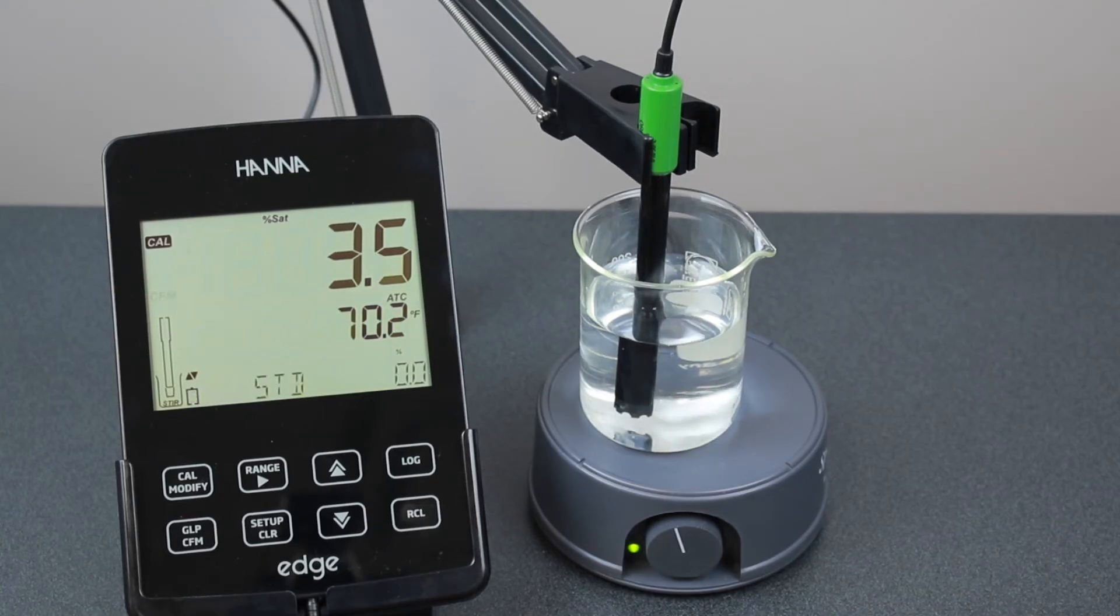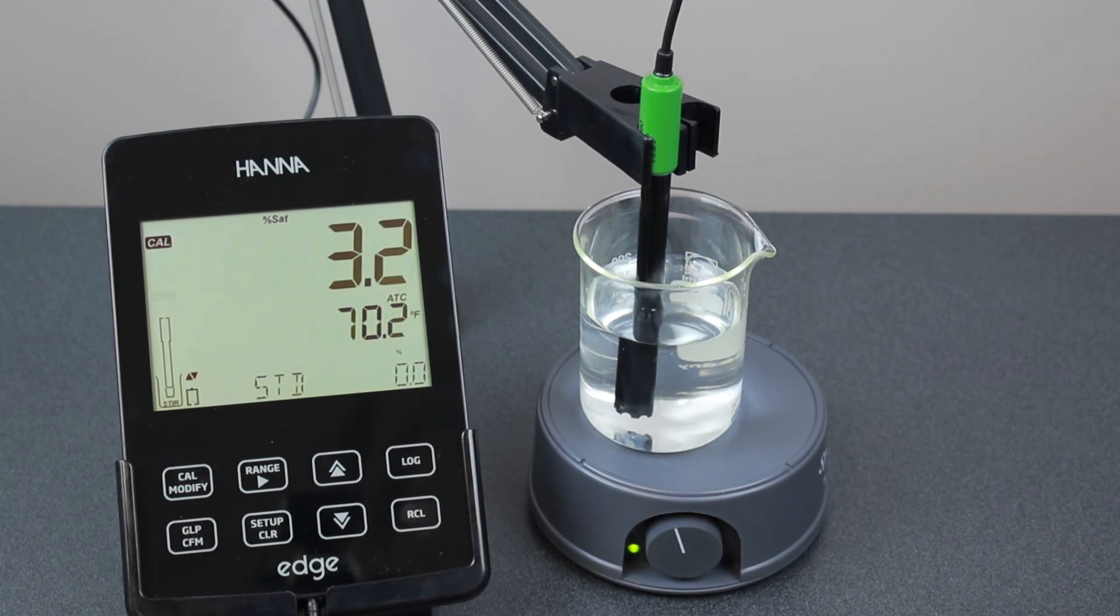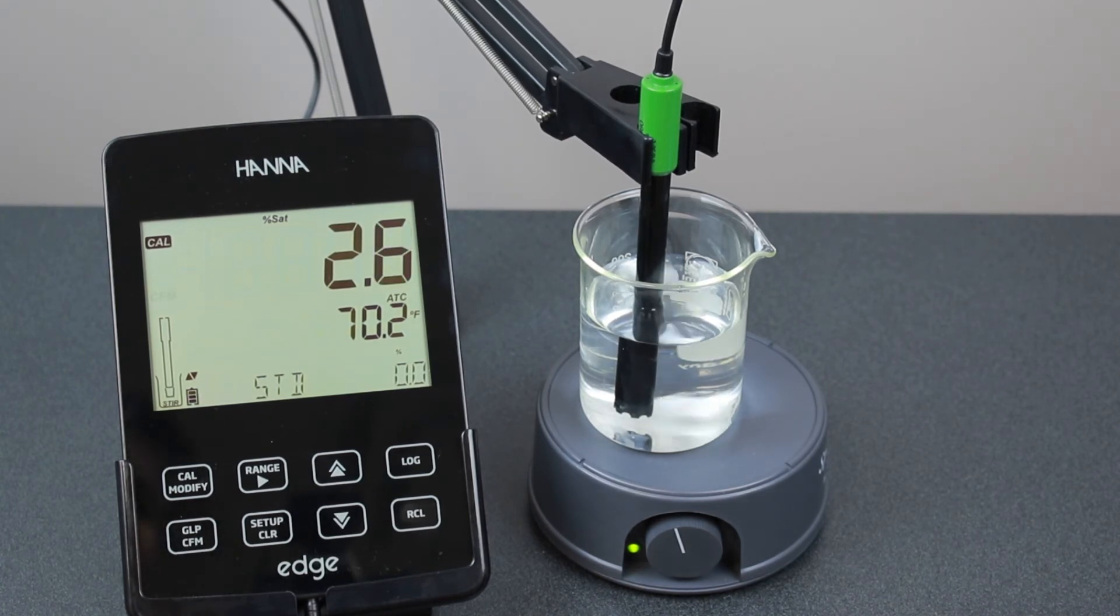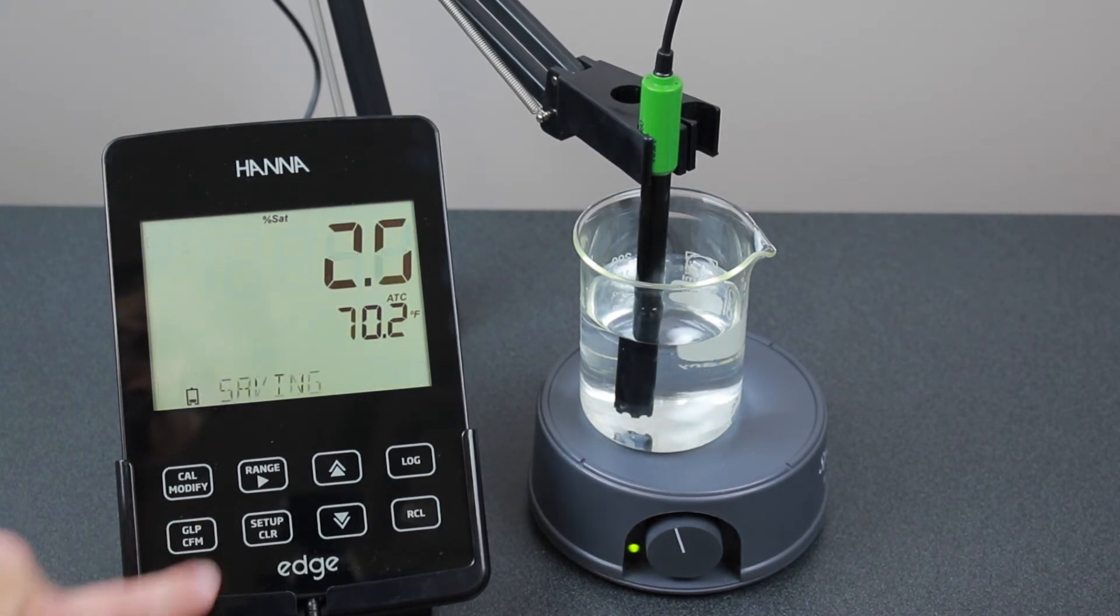Submerge the probe into a beaker containing HI70400 zero oxygen solution and stir gently for 2-3 minutes as the reading goes down. Be sure the temperature sensor is covered. When the reading is stable and stops decreasing, press confirm and the meter will automatically return to measurement mode.